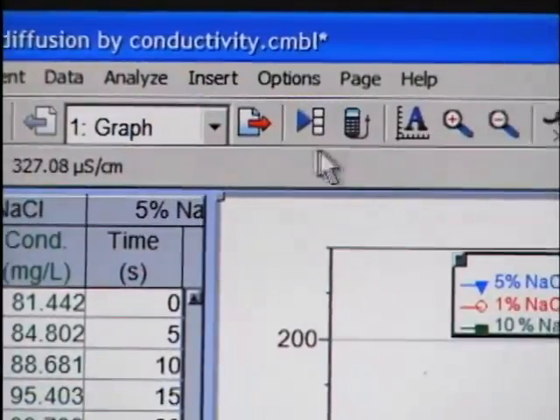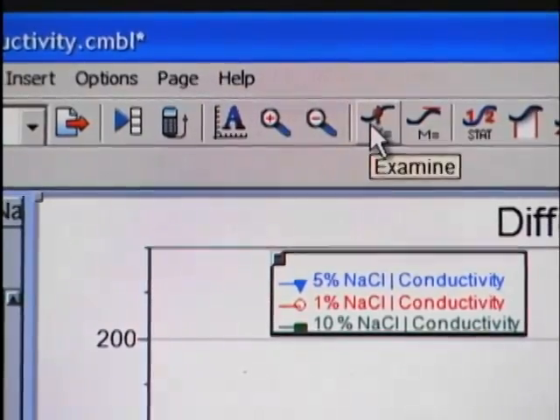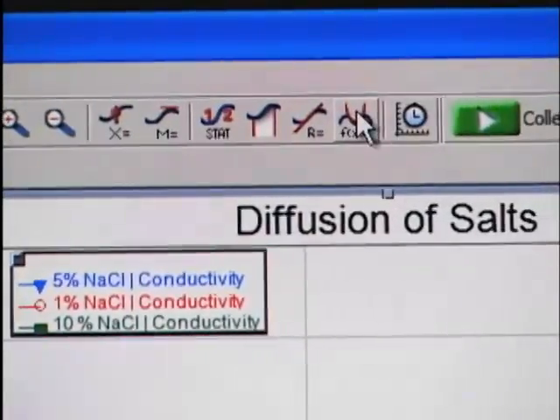There's a toolbar for easy access to common operations, such as setup, starting and stopping data collection, and doing basic statistical analysis.